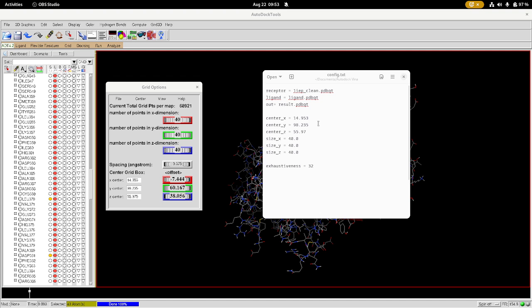And you can see I've got the center Y, center X, and center Z matching the numbers in my grid box over here, and then I've got the size of the grid box set the same as well.